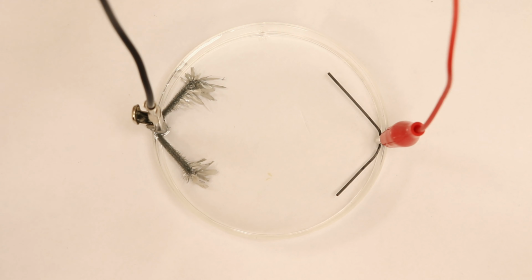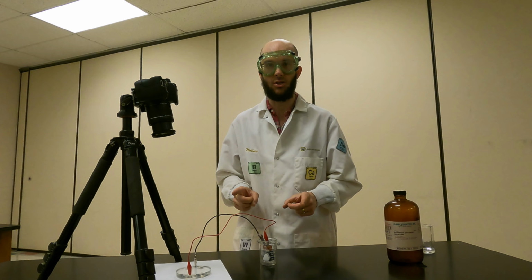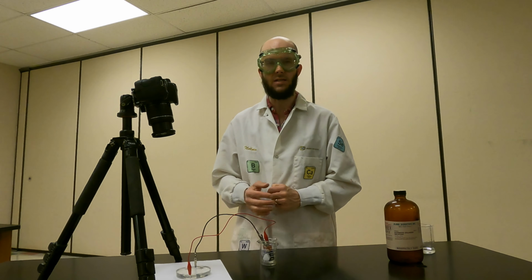And right away you can see something is already happening here. Now, keeping in mind that this is a decomposition reaction, what do you think is happening to the tin chloride in this reaction? What do you think these products are?